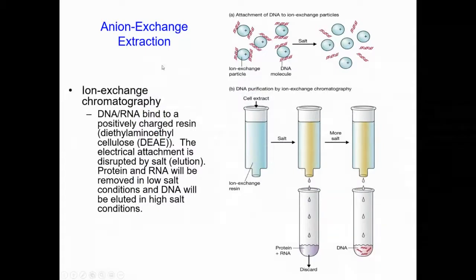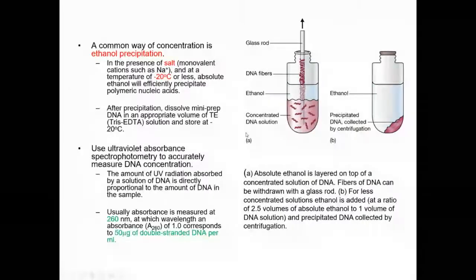And this is to show the anion exchanger, right? So you use the anion exchange resin to attract the negatively charged DNA and then separate the DNA from other materials. So that's the anion exchange extraction.